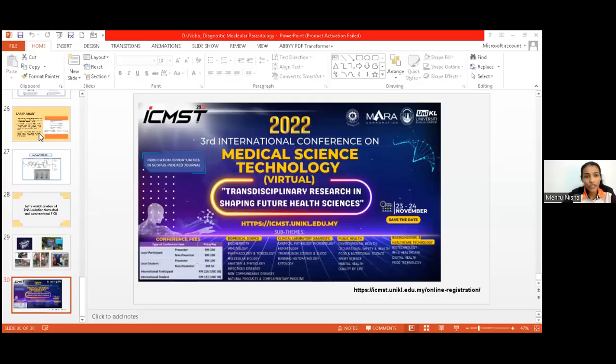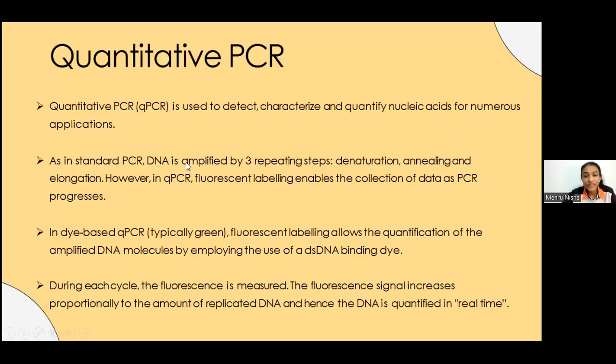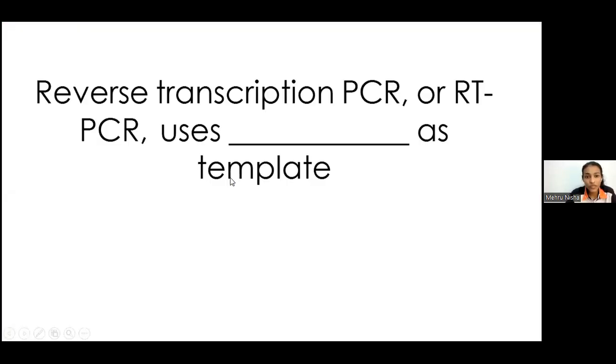I don't want to count the parasite. What I want to do is directly know how much amplicon I have. Quantitative, yes, qPCR. This is, in summary, the PCR that you use.